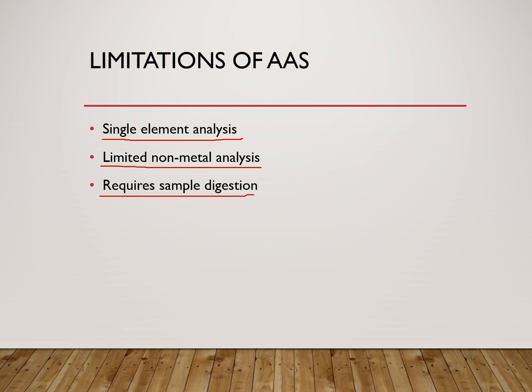For atomic absorption spectroscopy, the sample is digested and then analyzed.